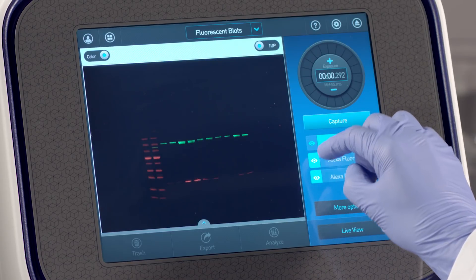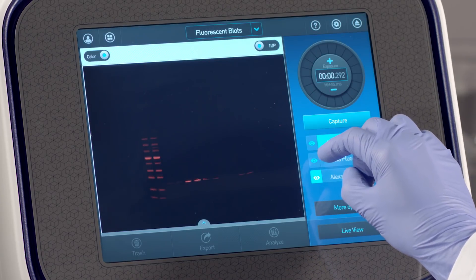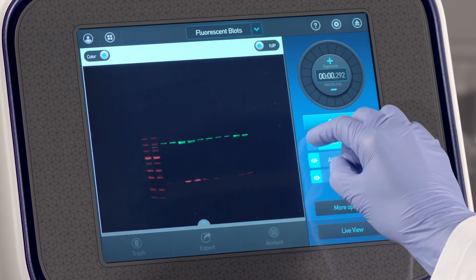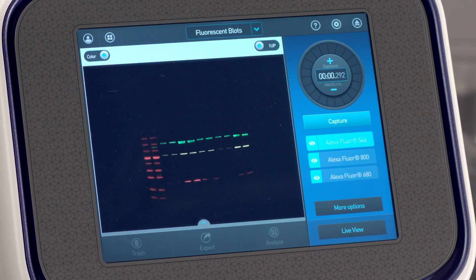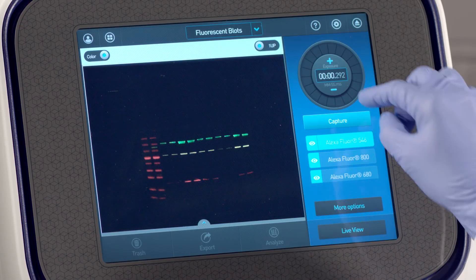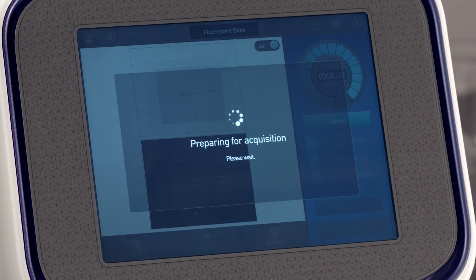Toggle easily between fluorescent channels for quick visualization, and manually adjust using the exposure dial if desired. When satisfied with the previewed image, tap Capture to acquire the image.